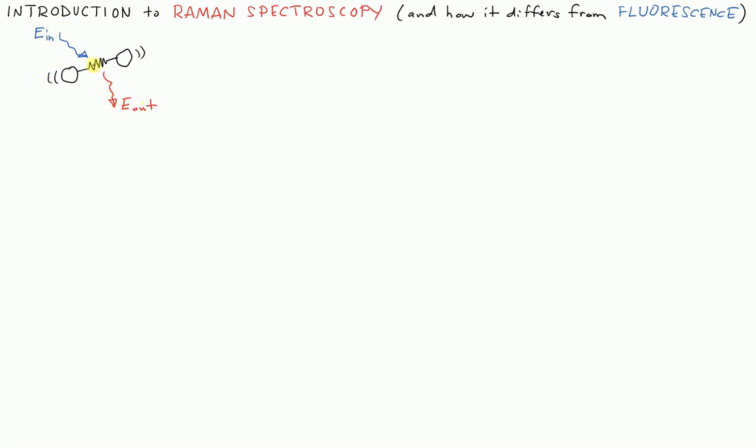You can think of it as an inelastic, instantaneous scattering event, and the molecule either gains or loses a quantum of vibrational energy. We can relate that to the same energy level diagram that we had in fluorescence. Let me make some of that appear for you here. Here you've got that plot of potential energy of the molecule as a function of the internuclear separation. And you'll recall that this well over here, around the equilibrium separation of the two nuclei, we can draw in some oscillator levels like that, vibrational sublevels.